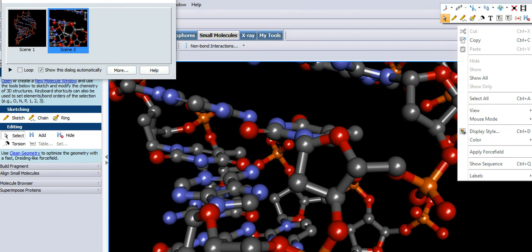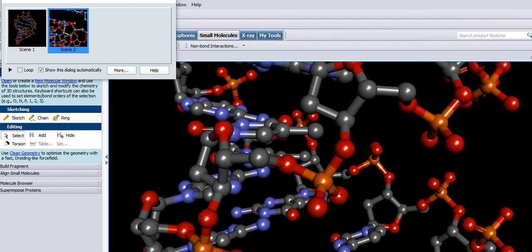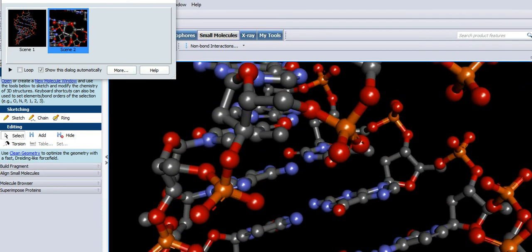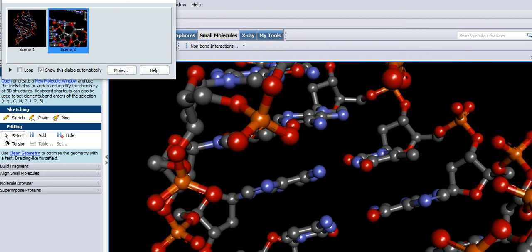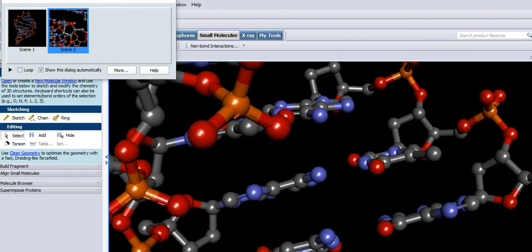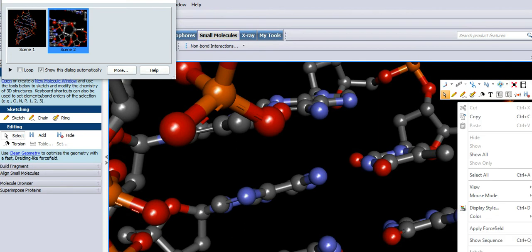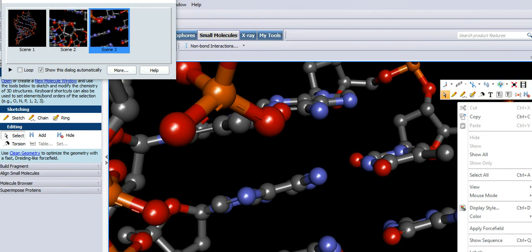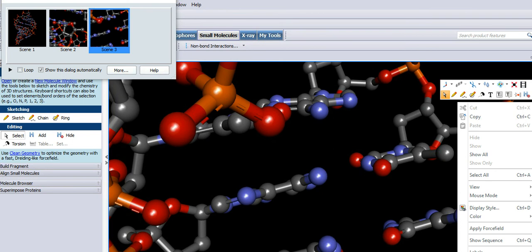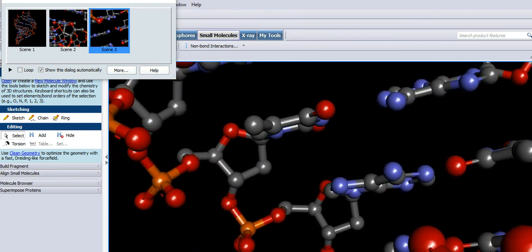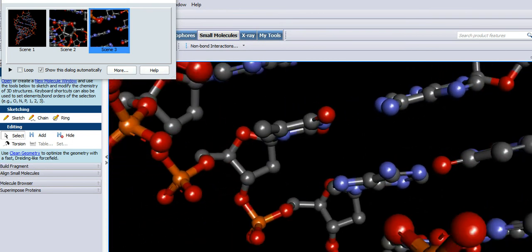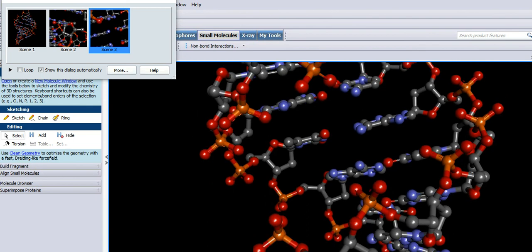Start rotating it. Zooming in a bit more. Another screenshot. And one more for luck. Let's zoom back out again.